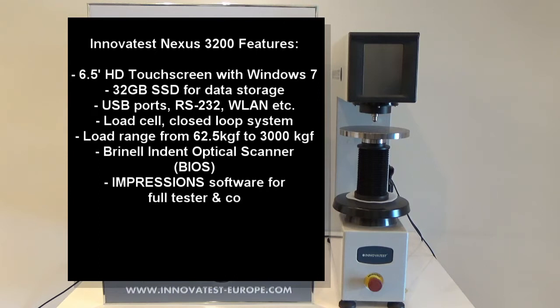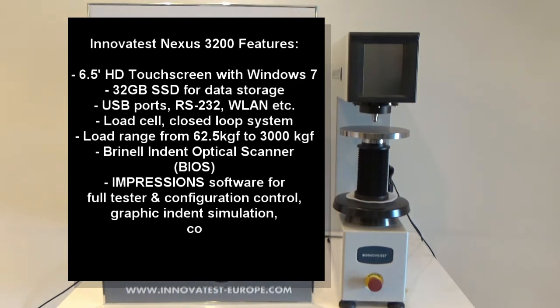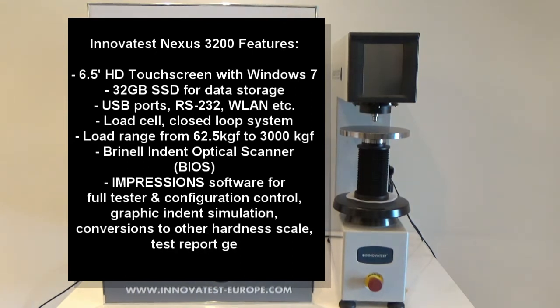The load range for this 3200 will be 62.5 kg force all the way up to 3,000 kg force, and it also comes with a Brinell Indent Optical Scanner which is used to measure the diameter of the indentation during measurement and to provide the results.